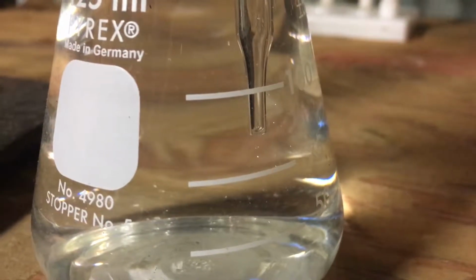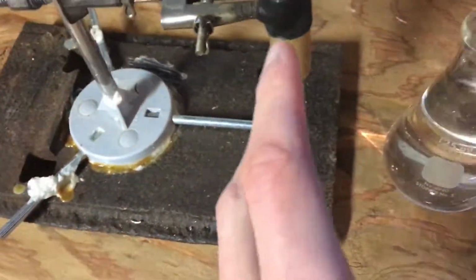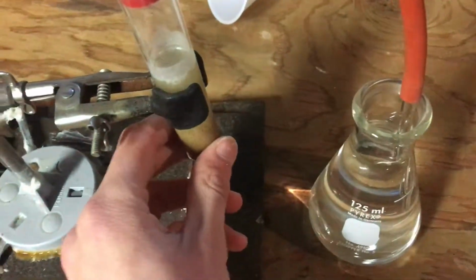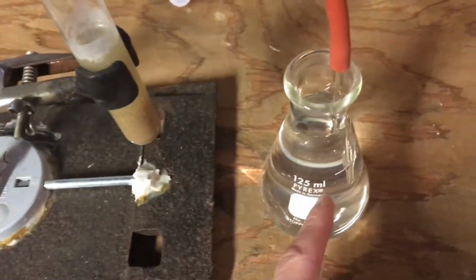So, I mean, not very good, but it works, I guess, well enough for my purposes. Yeah, that's basically it.